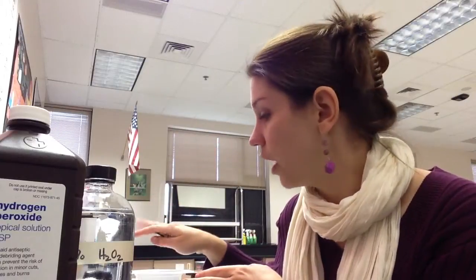There's 2 videos for the pre-lab for your enzyme labs because there's 2 different labs, and even though we're doing them both on the same day, you are going to have 2 completely separate labs in your lab notebook. So there's going to be enzymes part 1, which is what I'm showing you here, and then you'll have enzymes part 2, which is with the spectrophotometer. It'll be a separate video that will be posted right underneath this one when you get to that point.